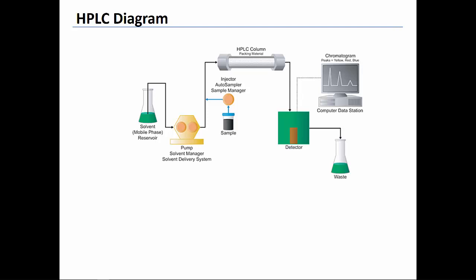Let's begin with a brief overview of HPLC. HPLC is commonly used to separate analytes within liquid samples. HPLC can also be used to quantify the concentrations of each component within such mixtures.